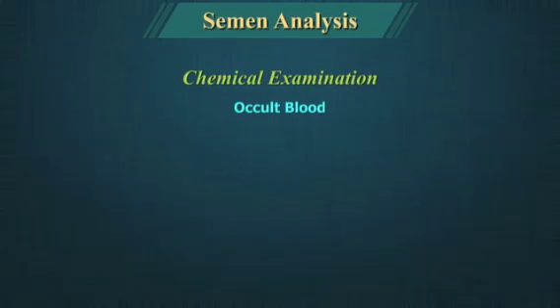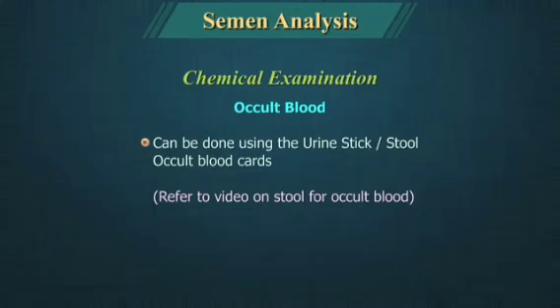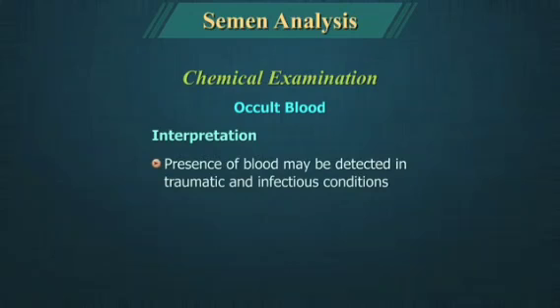Occult blood can be done using the urine stick or the stool occult blood cards. Presence of blood may be detected in traumatic and infectious conditions.